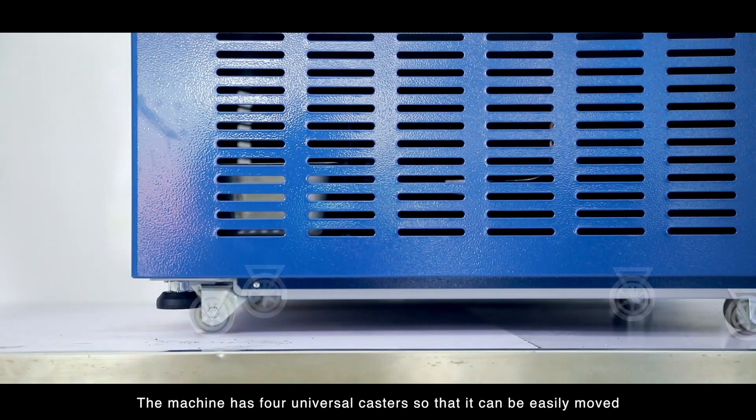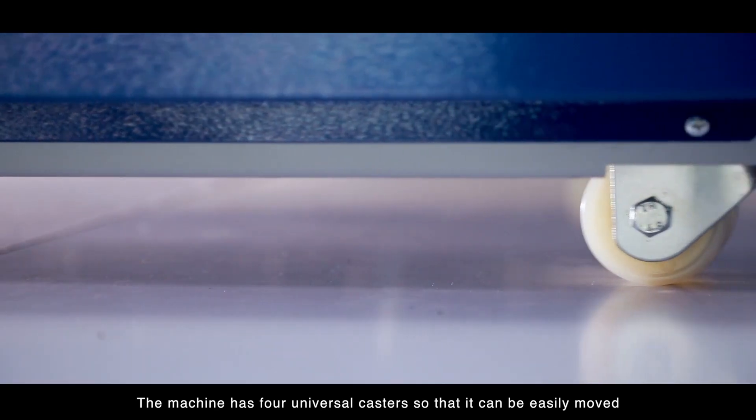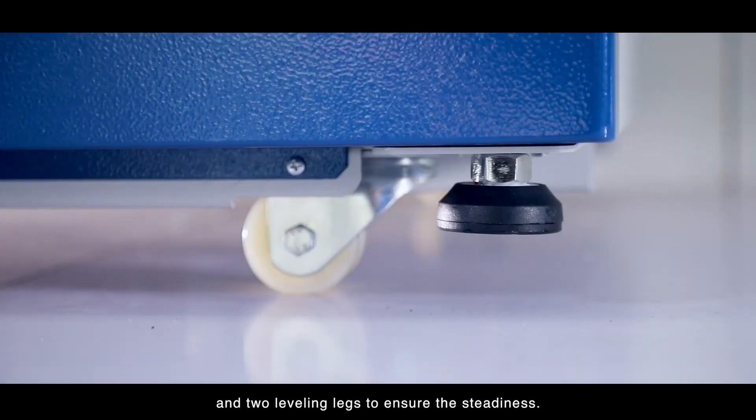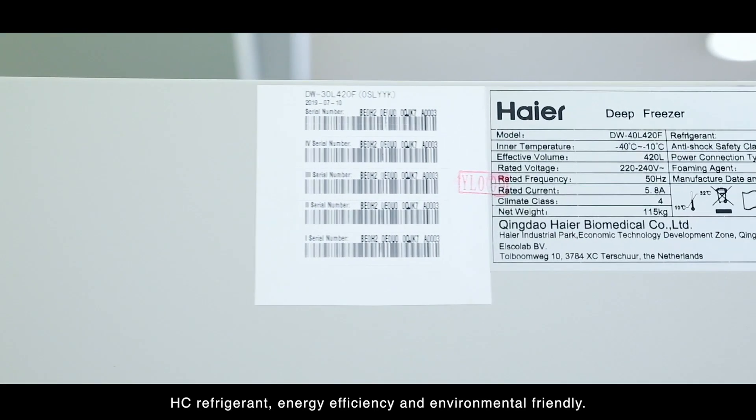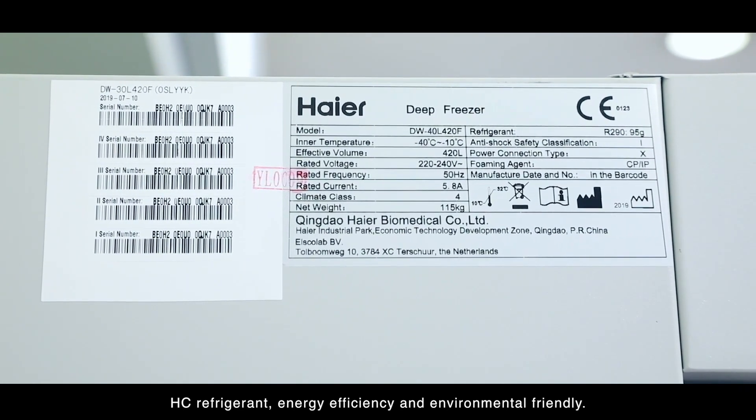The machine has four universal casters so that it can be easily moved and two leveling legs to ensure steadiness. HC refrigerant is used, providing energy efficiency and being environmentally friendly.